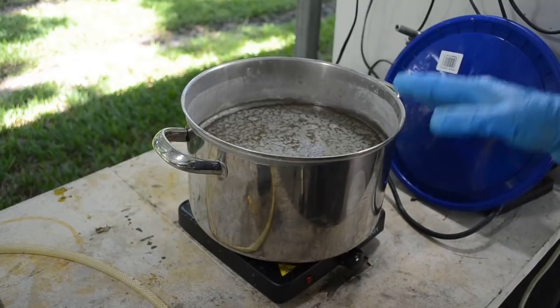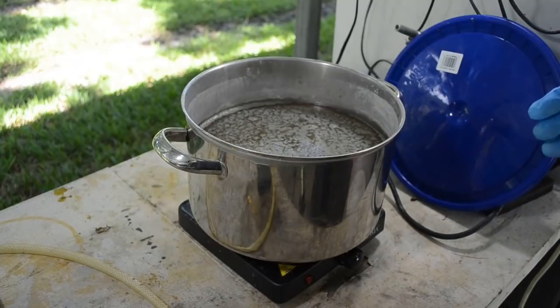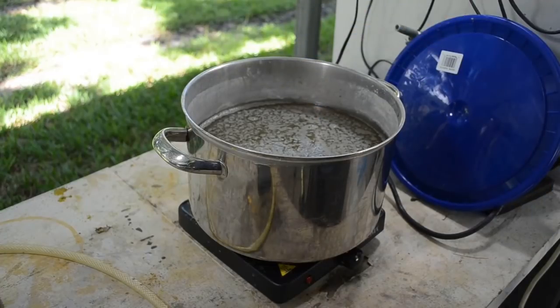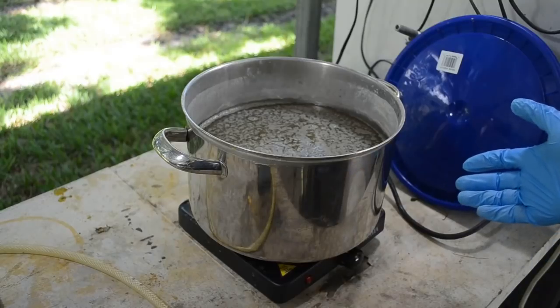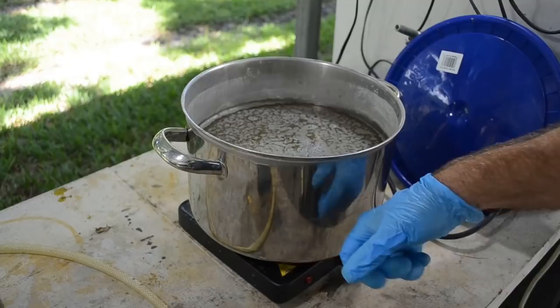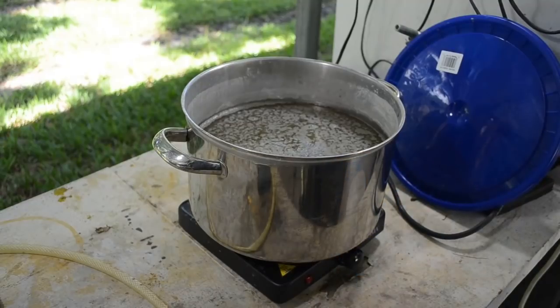So I've got the same filter set up I had before. I'm going to siphon all this stuff into my Buchner funnel and then vacuum filter it into the filter flask. And again, we'll have to do it in several batches because there's too much liquid here to fit in my 2-liter flask. In fact, after all the dilute acid I've added, there's probably close to another liter here that wasn't there before. So, got to do that.